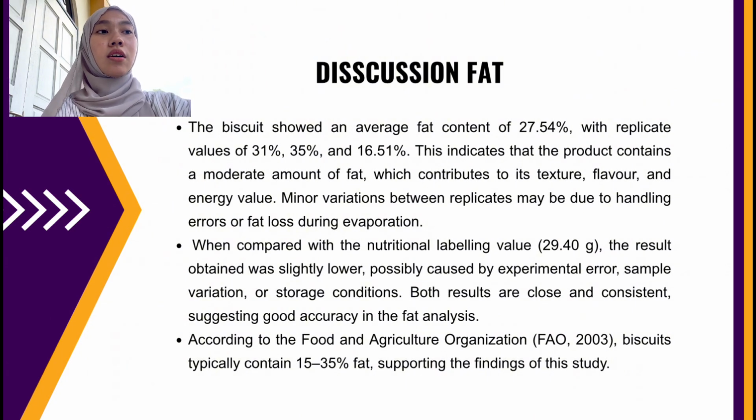But both values are close and consistent, suggesting good accuracy in the fat analysis. According to the Food and Agriculture Organization, biscuits typically contain 15 to 35% fat. So, this supports the findings of this study.